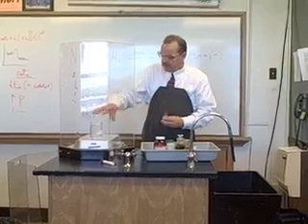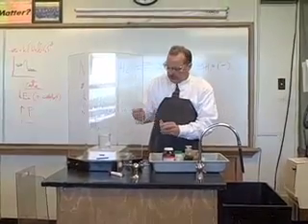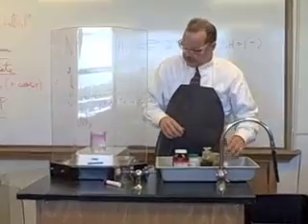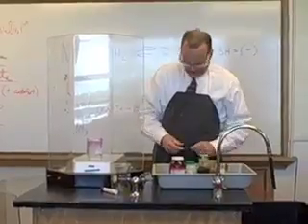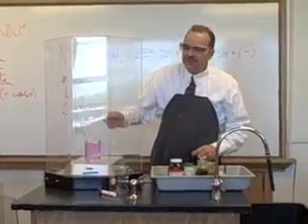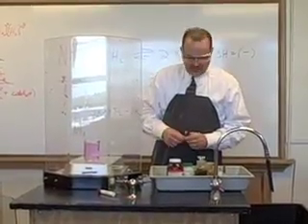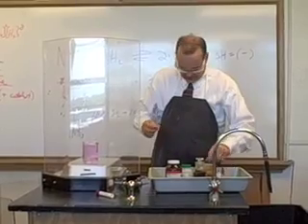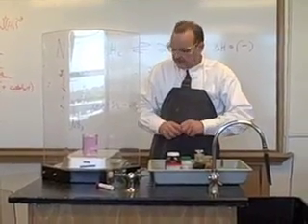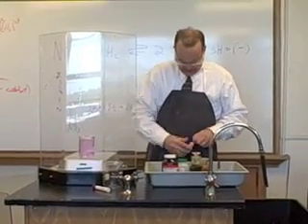Let's begin with a beaker of just regular water. I'm going to put some phenolphthalein in the water, and you see the water begin to change colors. It changes colors because water is basic. You remember this from the first day of school, where I put the phenolphthalein in the water and it turned pink because water has base in it. Phenolphthalein is pink in the presence of a base. I'd rather it not be pink right now, so I'm going to put this in.